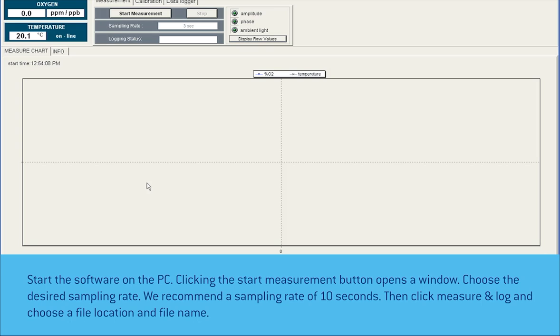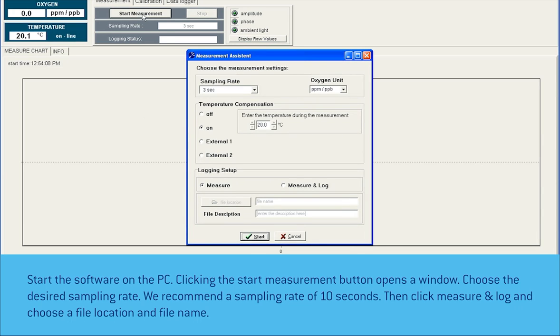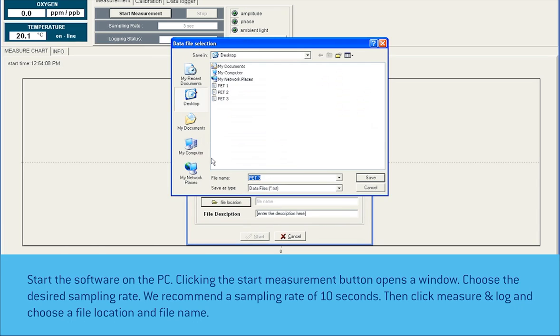Start the software on the PC. Clicking the start measurement button opens a window. Choose the desired sampling rate — we recommend a sampling rate of 10 seconds.